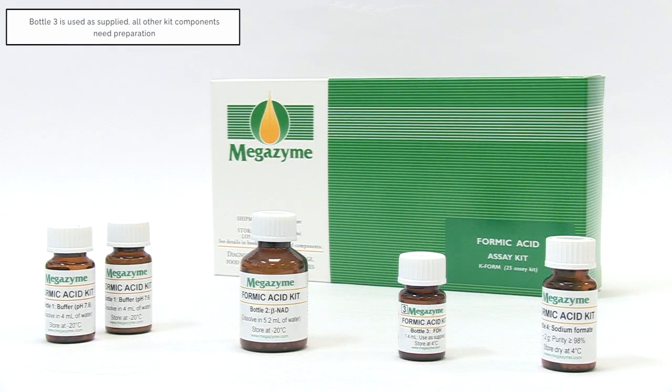Bottle 3 is used as supplied. All other kit components need preparation.